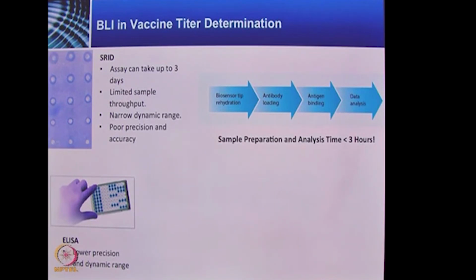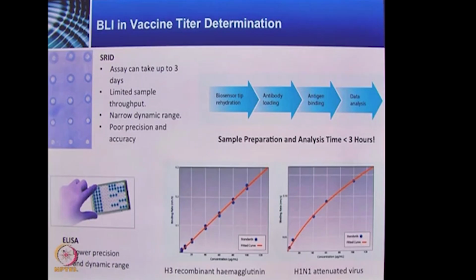experiments. And as we can see here, from the sample preparation to the time we get the final results, it only takes about 3 hours for you to finish the whole process.